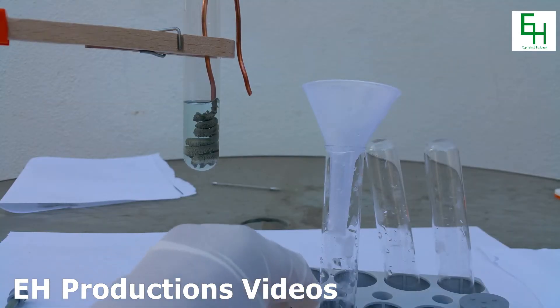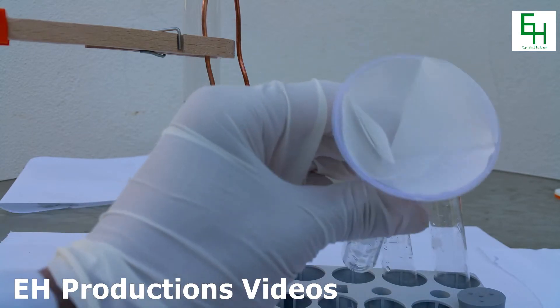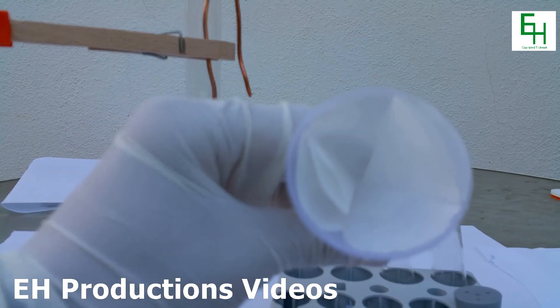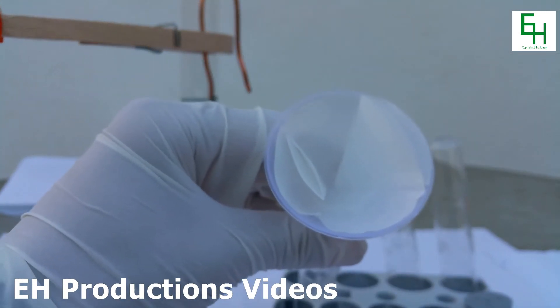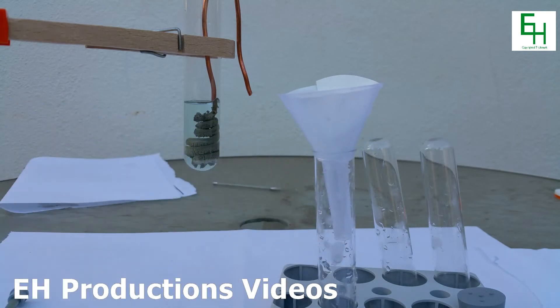Alright. We'll be using a filter paper and a funnel to filter out the copper powder. I mean, not the copper powder, the silver powder that has been formed in the reaction. So here we go.